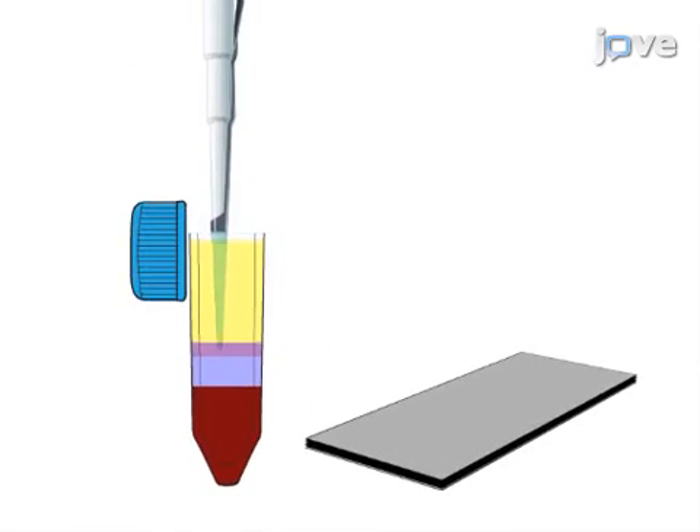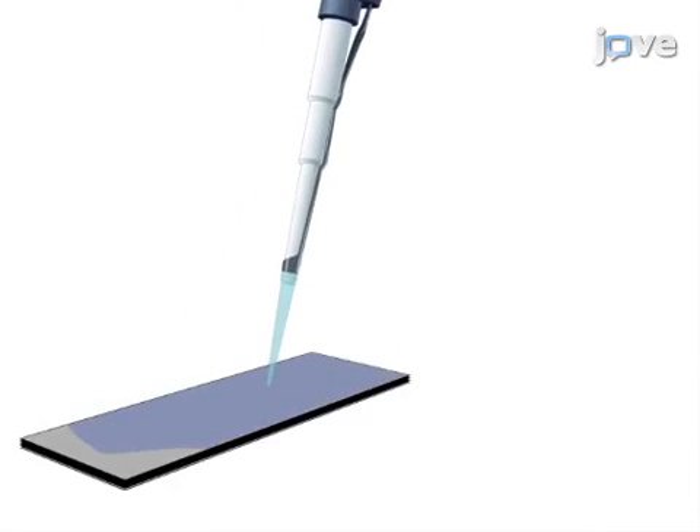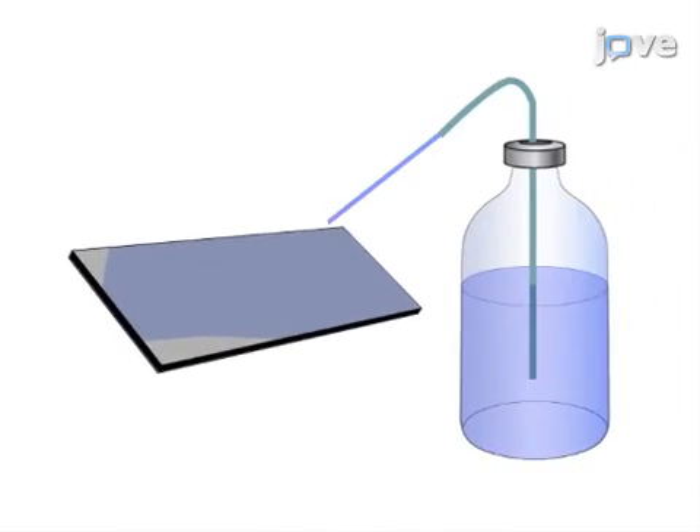The second step is to prepare sample slides by smearing or pipetting the blood cells and then treating them with fixative solution followed by washing.